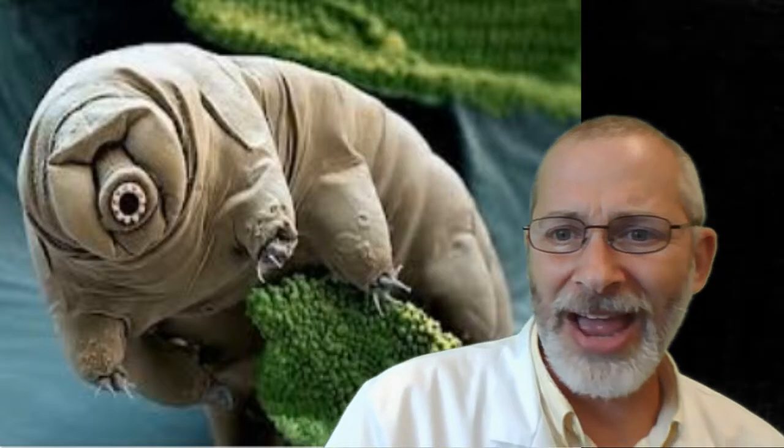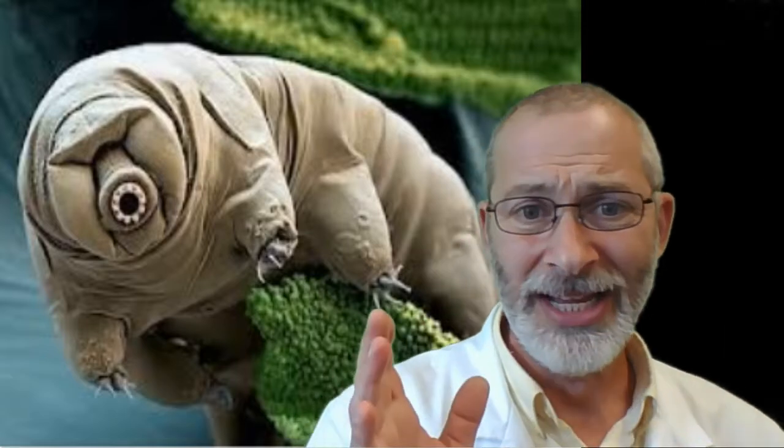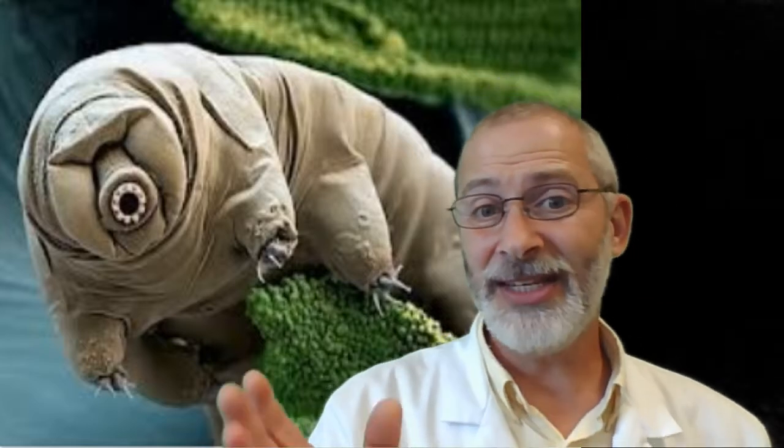Oh, these are cool. This is a water bear. They're found in mossy environments, but they are such cool critters that scientists have been studying them for a while, because they have recently been found to be able to survive the vacuum of space, believe it or not.